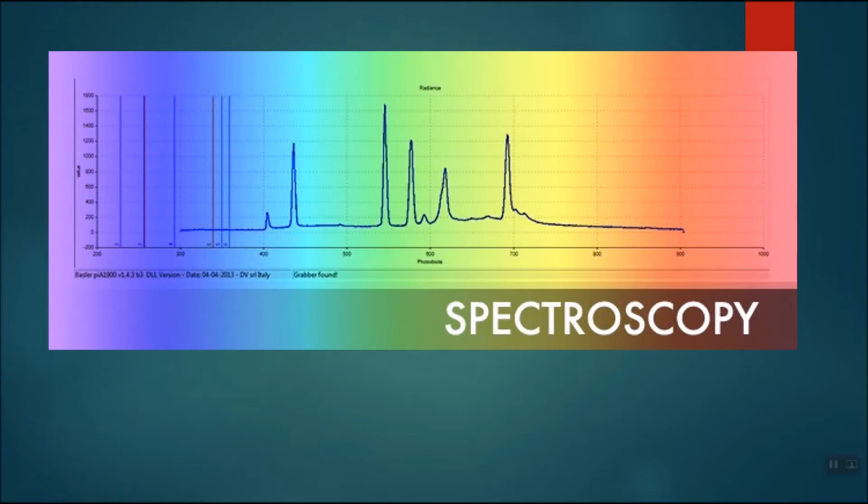And over the years, we have learned what kind of light this is. We have measured it, and now it's all in computers. All we need to do is focus our instruments on anything that is emitting light, and we can figure out what kind of chemical it is by its light fingerprint.